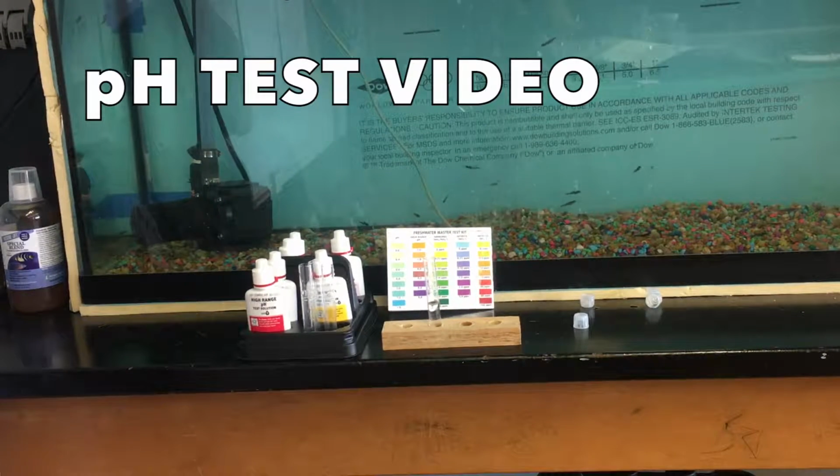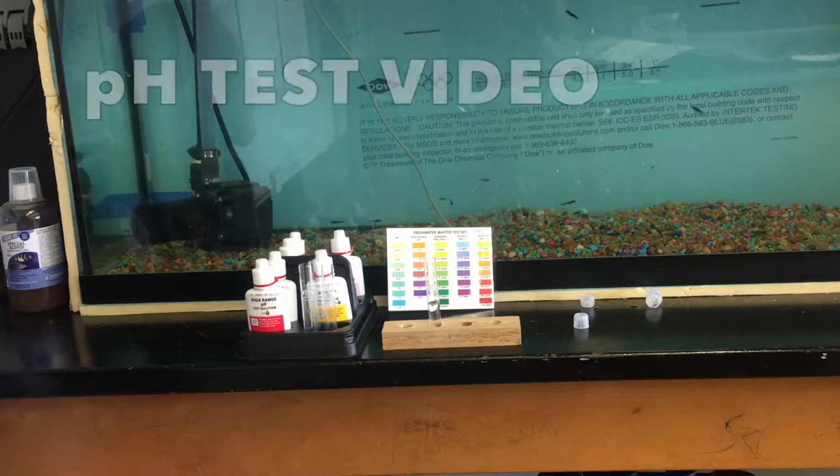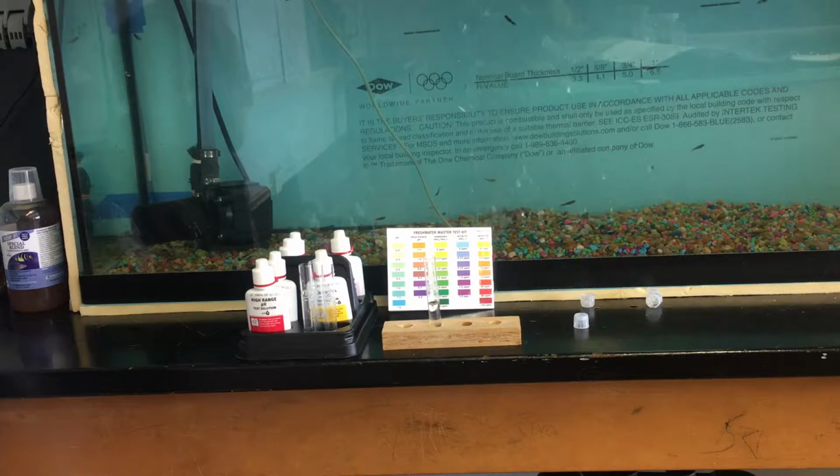We're going to show you now how to do a water quality test for pH in your trout tank. pH is a measure of acidity of the water. The lower the reading that you get at the end of this test, the more acidic the water is likely to be. We want to maintain a pH in the tank of between 7.4 and 8.